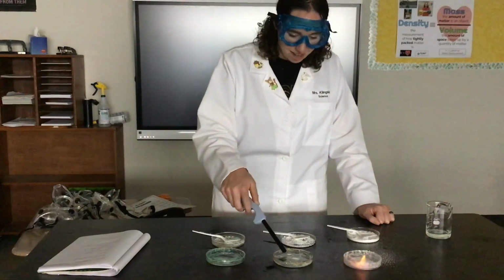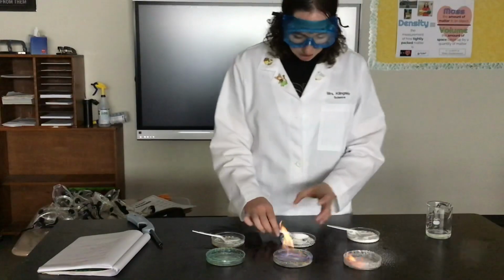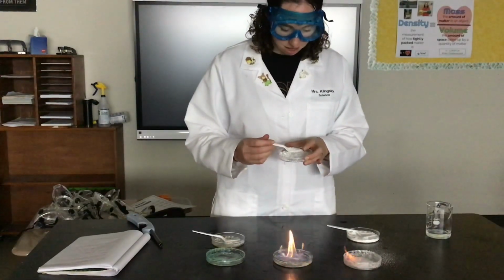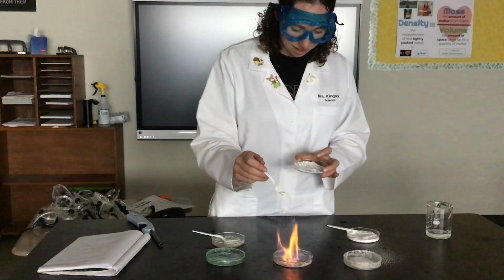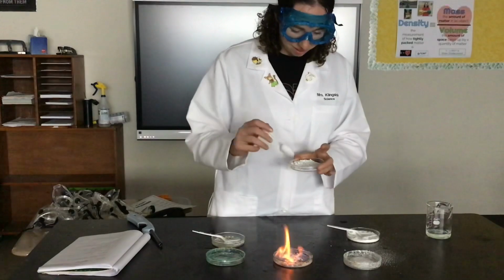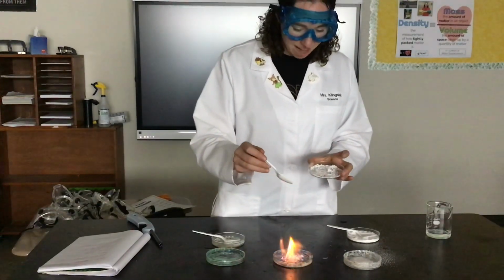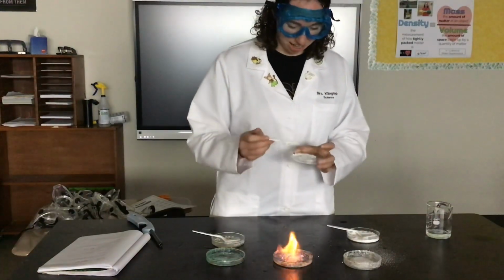All right. So again, lighting my ethyl alcohol on fire because it is flammable. Okay, now I'm going to take my calcium chloride. Again, look at the color. Okay, here we go. See how it turns it red? That lets me know that what type of change has happened? Chemical. It's a color change.